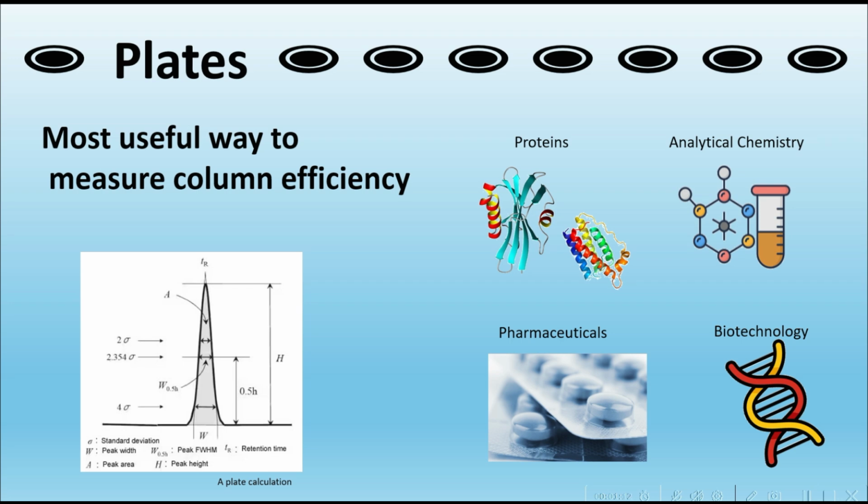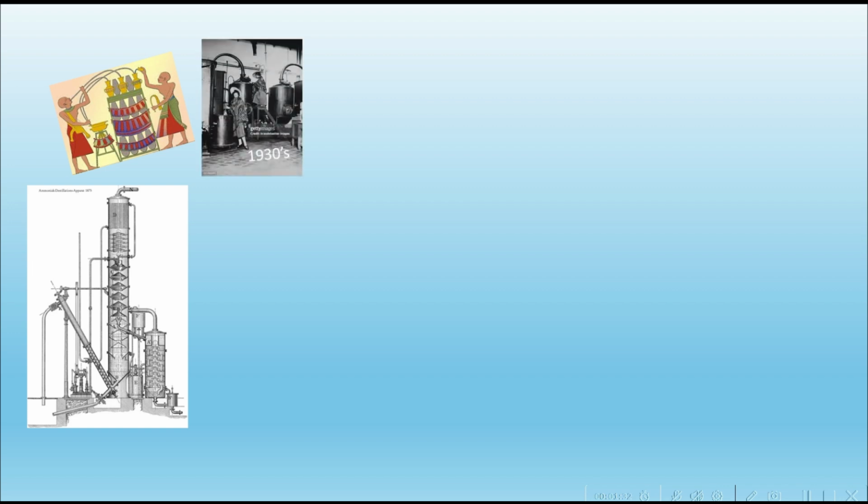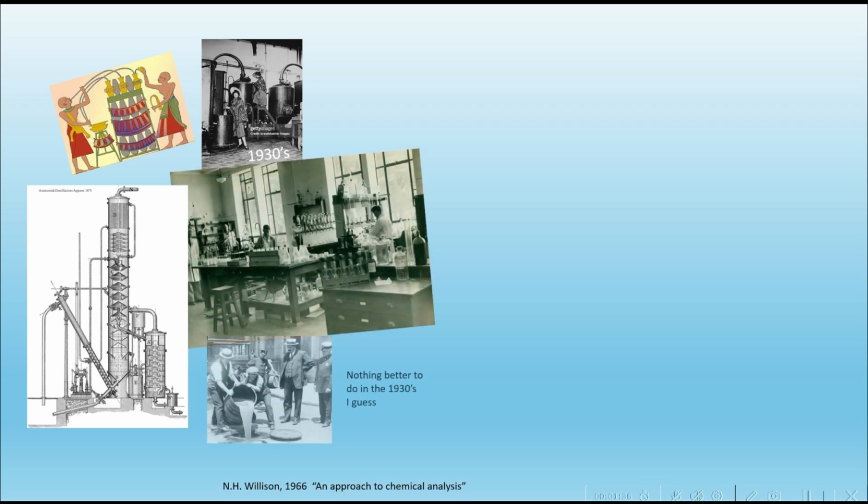So let's get started. The concept of distillation is very old, dating back to antiquity, and people have been using fractional distillation for separating spirits and petroleum for what seems like forever. But it wasn't until about the 1930s that laboratories really understood the value of fractional distillation and developed precise distillation equipment.